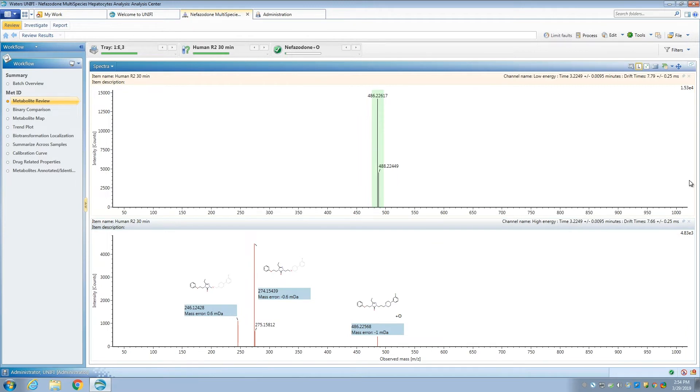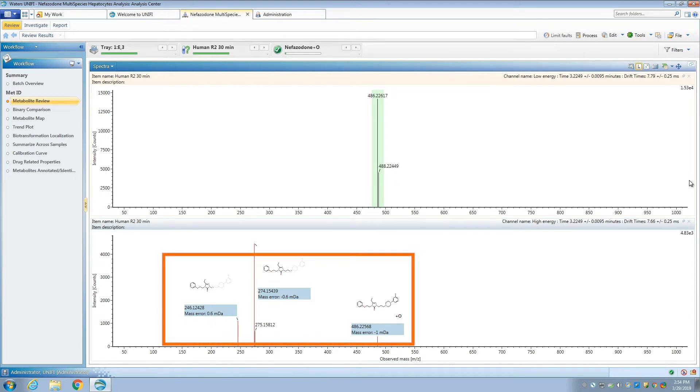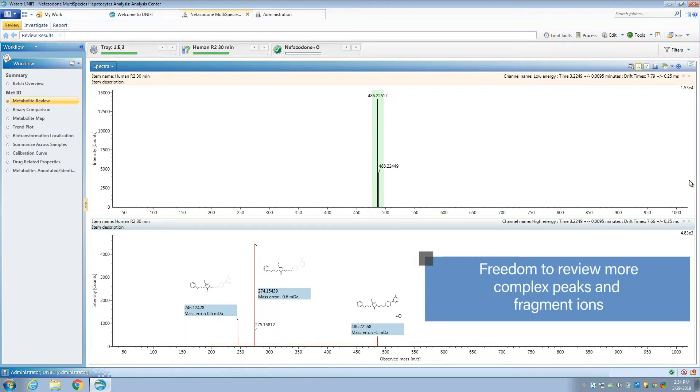While we're looking at spectra, we can also see that UniFi software has automatically annotated simple fragment ion peaks. This gives MetID scientists freedom to review more complex and potentially critical peaks and fragment ions.